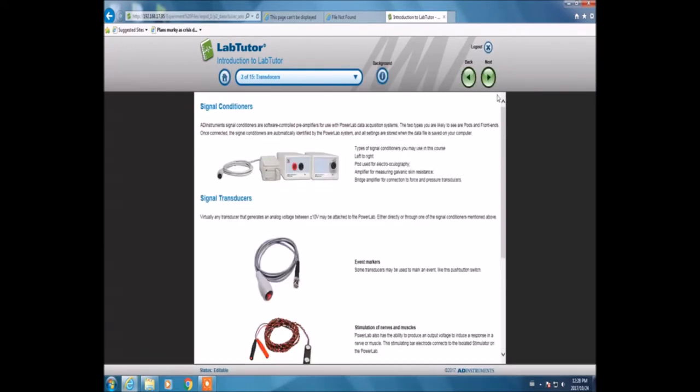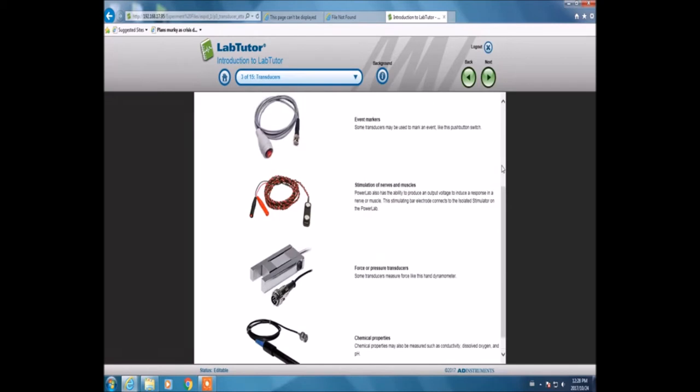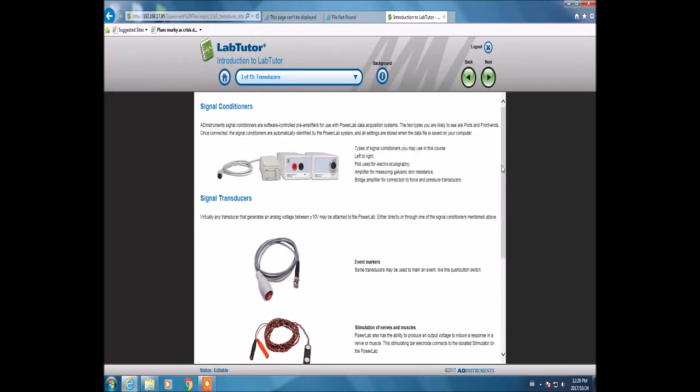This is the signal conditioner and signal transducers, which shows me the list of various components that can be attached to perform the experiment.